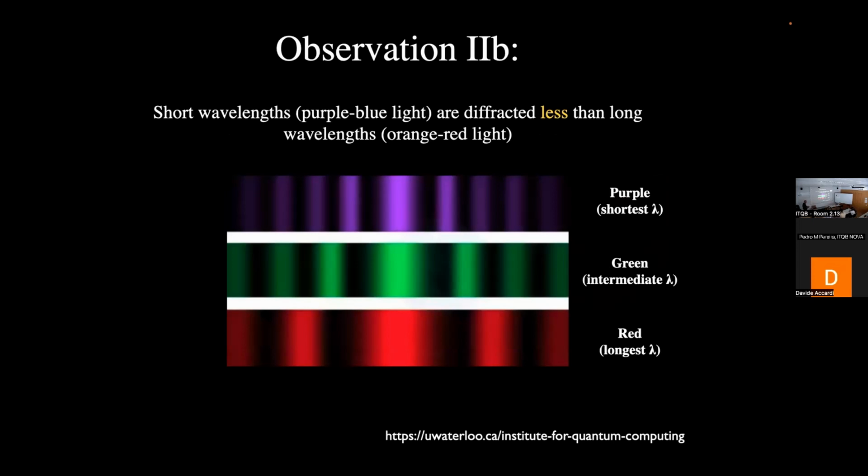And in fact, we had this effect that you could see with the green. The diffraction pattern in green was actually smaller, and there were more spots than when doing it with red. And the blue light was so small it was almost impossible to see, with very little contrast. Okay, so this is very important. Larger features, smaller diffraction pattern; shorter wavelength, smaller diffraction pattern.